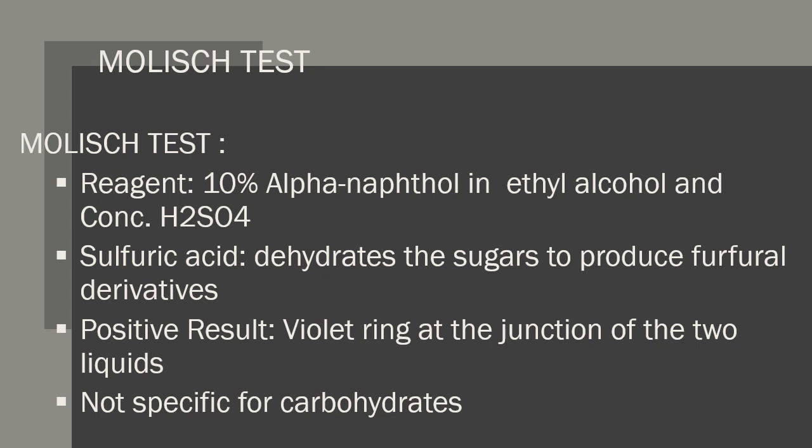Okay, and so you have there, of course, your Molisch test. It's a general test for carbohydrates, either combined or not. Your glycolipid has carbohydrate in it, and so the carbohydrate content is responsible for the positive result. This one is a general test, and it indicates that there is a carbohydrate in a solution. That is it for your Molisch test.